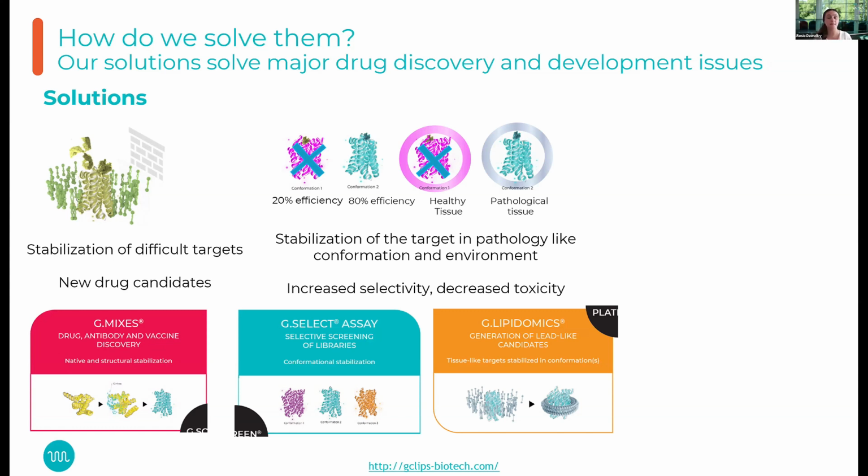We also went a step further, and we have made a library, and we did studies in lipidomics, where we extracted the lipids from 30 different cell types.